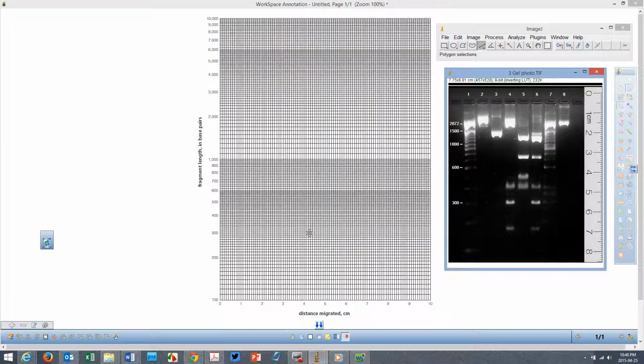Alright, in this third video, I'm going to explain specifically how you go about doing the final step in the image analysis. It's the most important step. It's the one that you'll be doing in the plasmid mapping. It's also the one that you'll be doing in the wet lab later this week. If I skip down to look at the instructions here, it says analyzing images, measurement, determining DNA fragment length. I'm not necessarily going to say it in exactly the same words, but you'll still get the same gist.